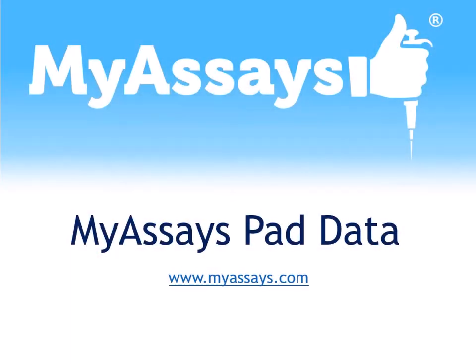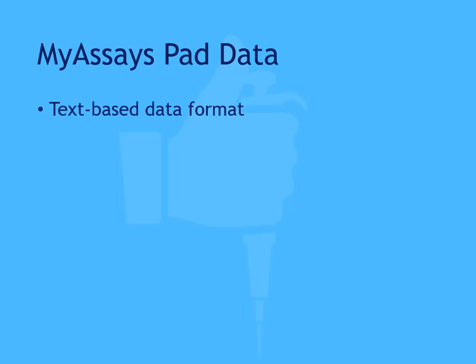In this video, we'll go over how to use MyAssays Pad Data. MyAssays Pad Data is a simple and efficient text-based data format developed by MyAssays for representing different types of measurement data in a cross-instrument and version-proof manner.